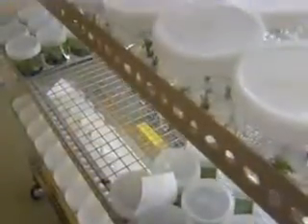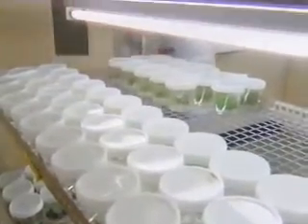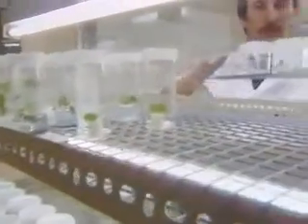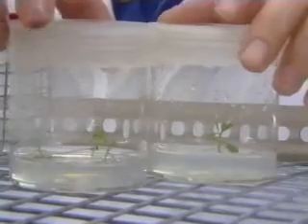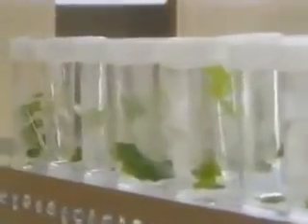These cultures are then transferred into the growth room with diffused light. The light intensity in a growth room like this is about 50 micromole per square meter per second, which is about 1/50th of sunlight on a cloud-free day. So it is not very strong.